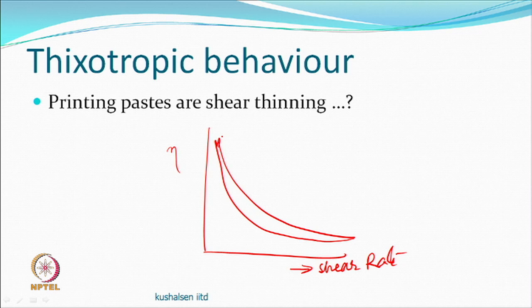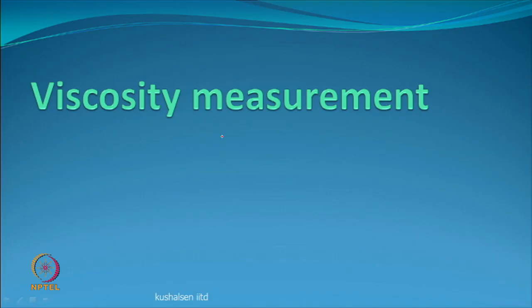So, that is the sensitivity towards this, but this sensitivity is every type of polymer that we would require for printing. This is not pH dependent, although we all understand viscosity is temperature dependent. So, if you increase the temperature, then things will be different. So, whenever you measure, you will have to say at what temperature did you measure. Not only that, people will like to know how did you measure.